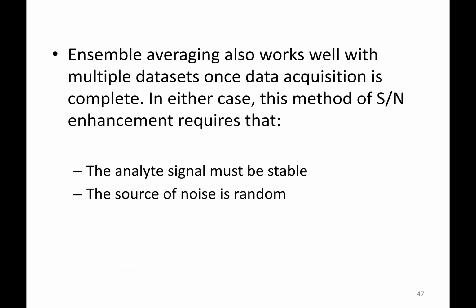These are the two requirements. And normally you want to make sure your instrument is stable. Sometimes you let it run for a few minutes, 10 minutes, sometimes 1 hour, depending on the instrument, for the circuits to stabilize. That is why we turn on instruments and let the instrument warm up, okay? Those kinds of things.